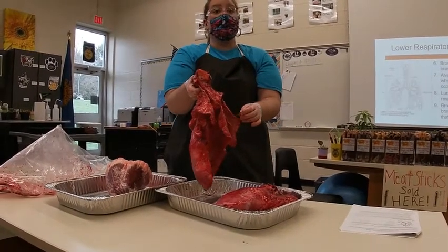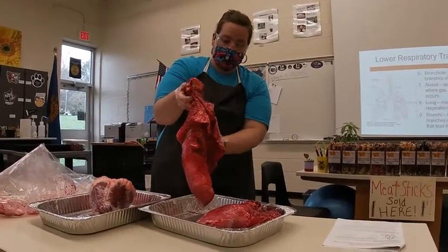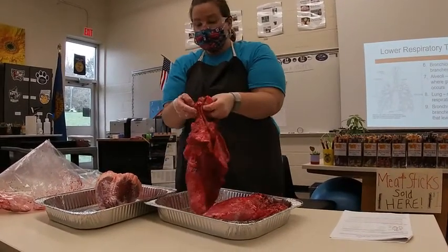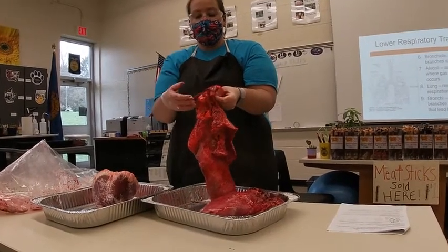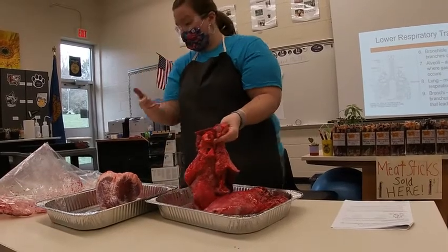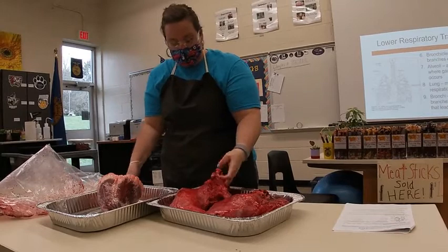The lung — it's super cool. So to inflate the lungs, this happens inside any animal who has lungs when they breathe in oxygen. I might actually need a volunteer because I'm not sure I can do it by myself.